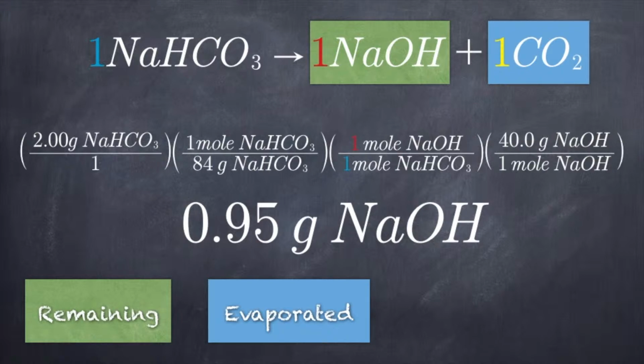We're not sure if this is actually the chemical equation that occurred, but students were supposed to figure out if this was the decomposition equation that occurred. So what students did is they balanced the equation, and we ended up finding that it was already balanced with a 1:1:1 mole ratio, and that was using stoichiometry.